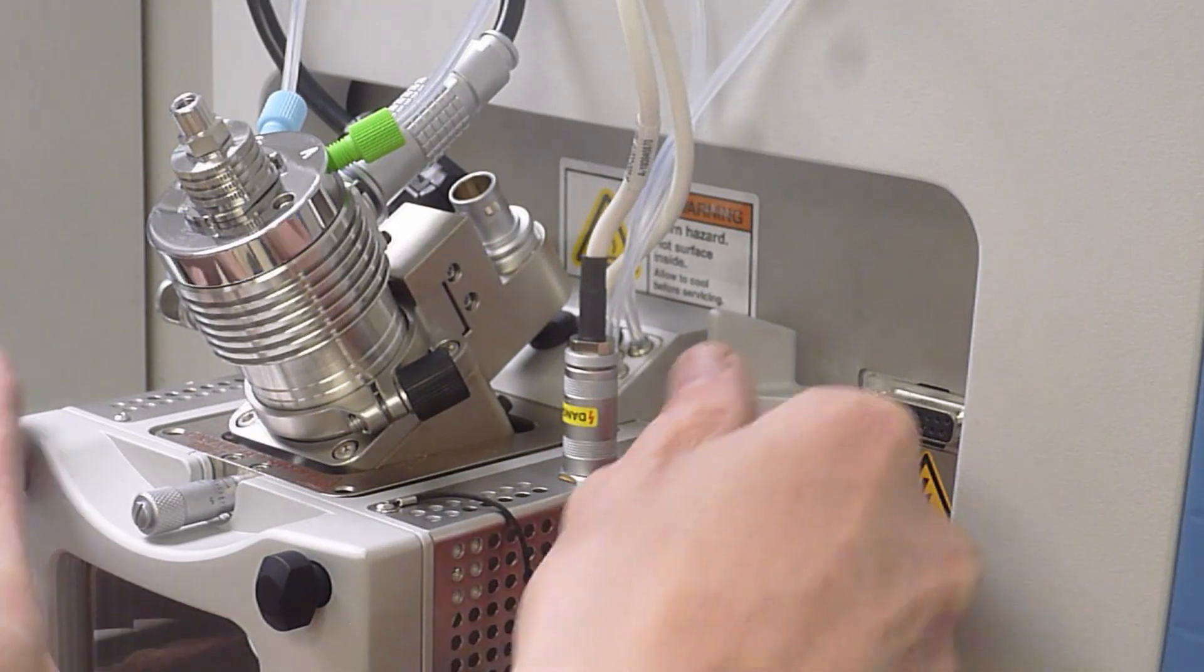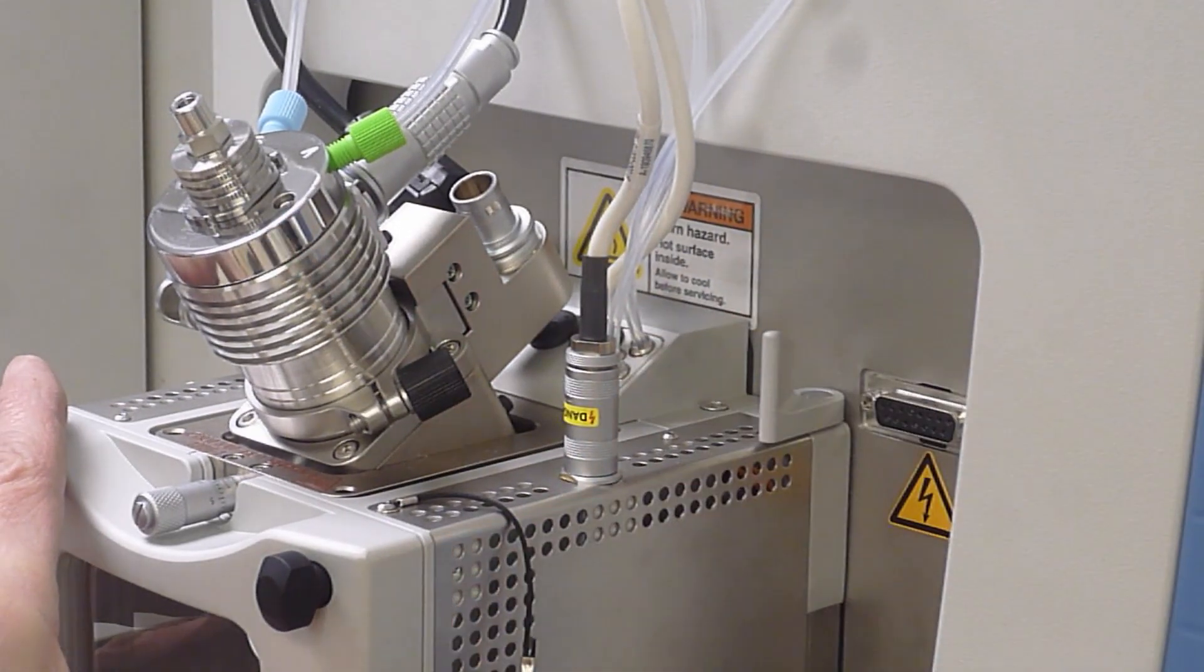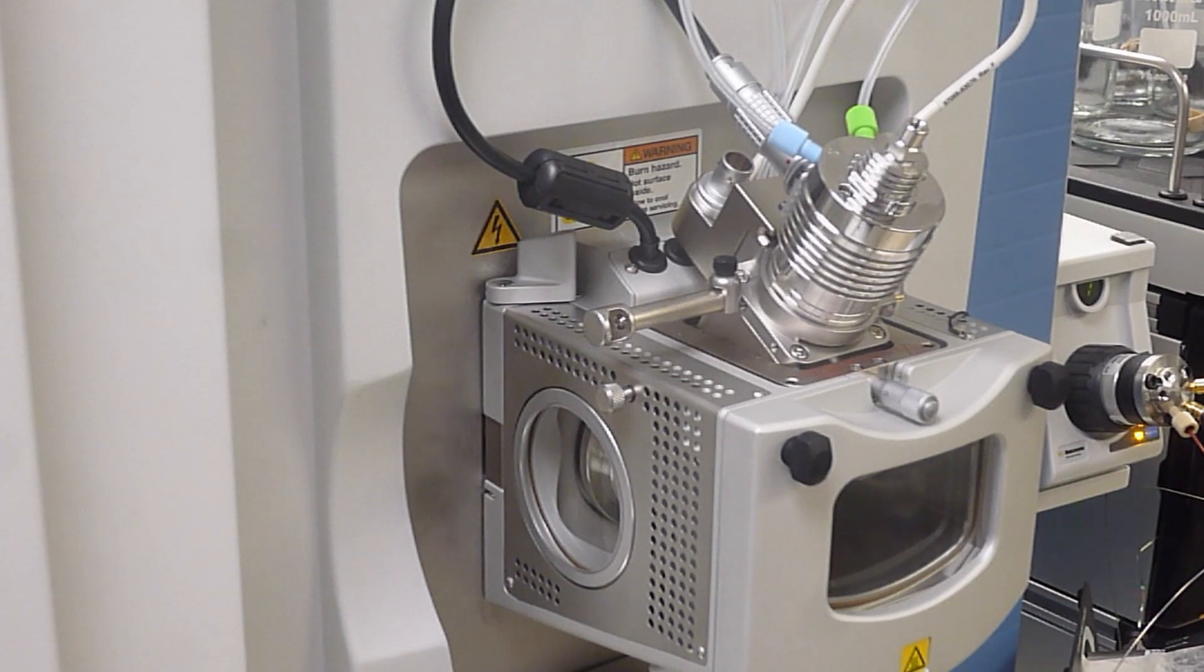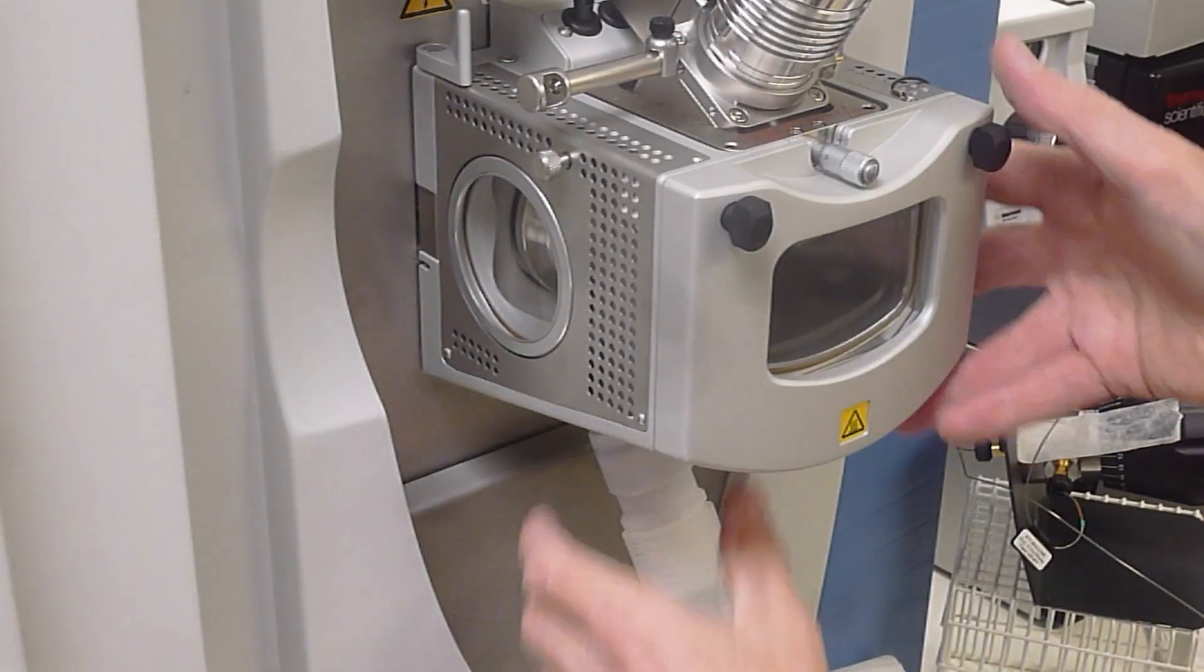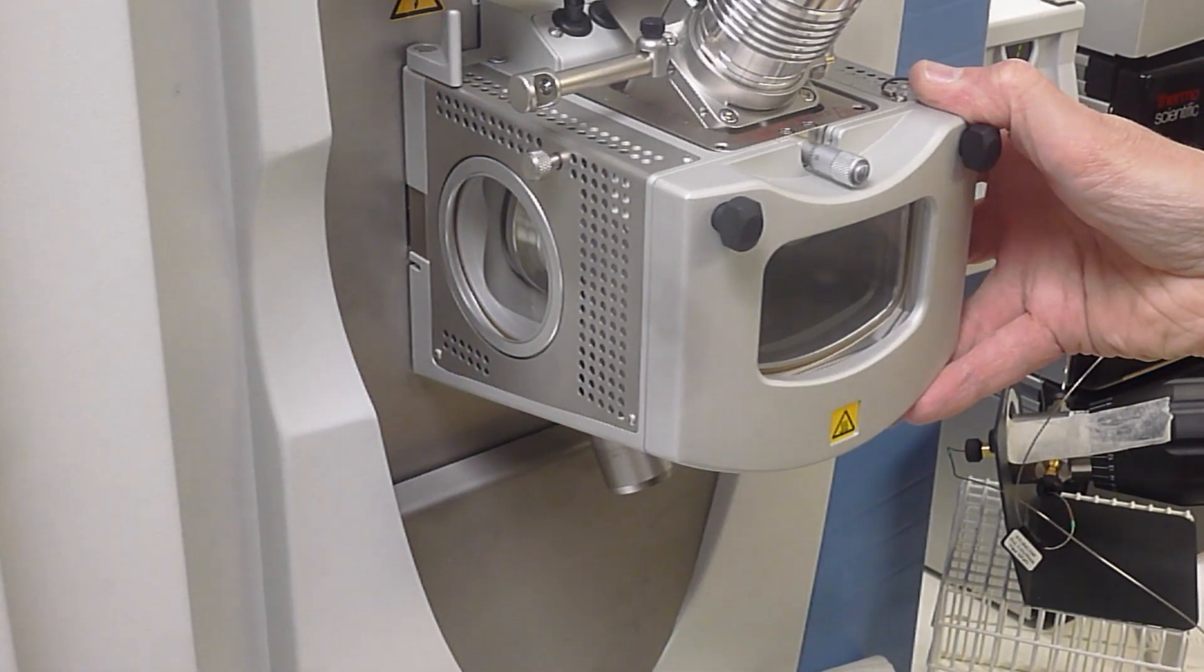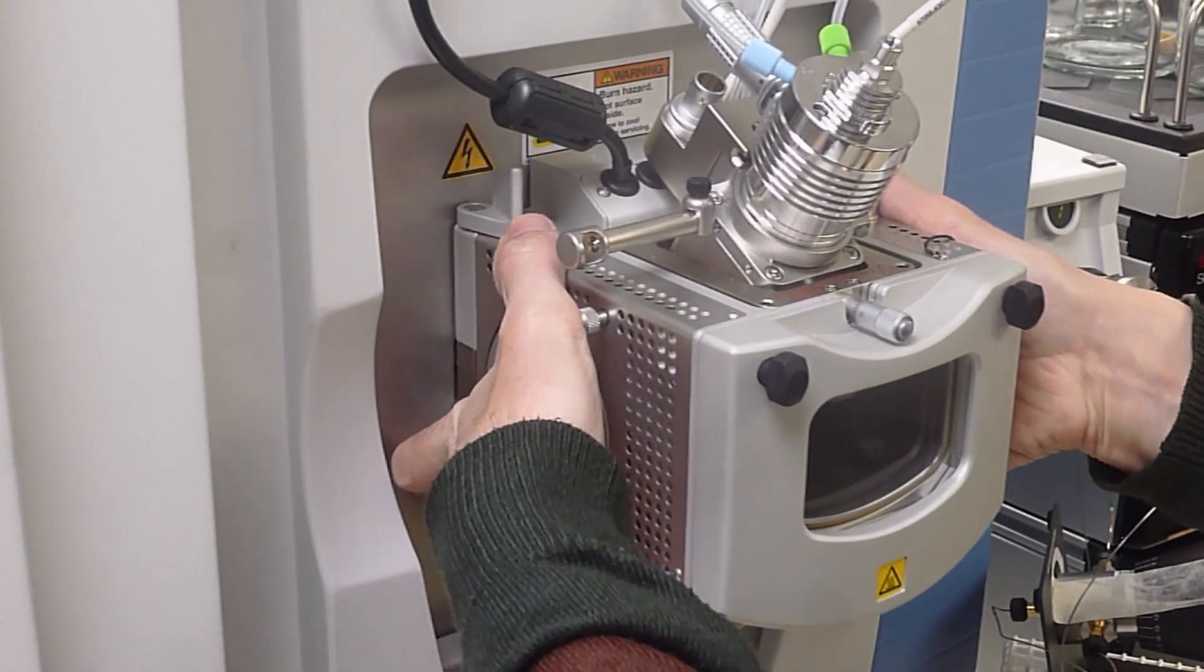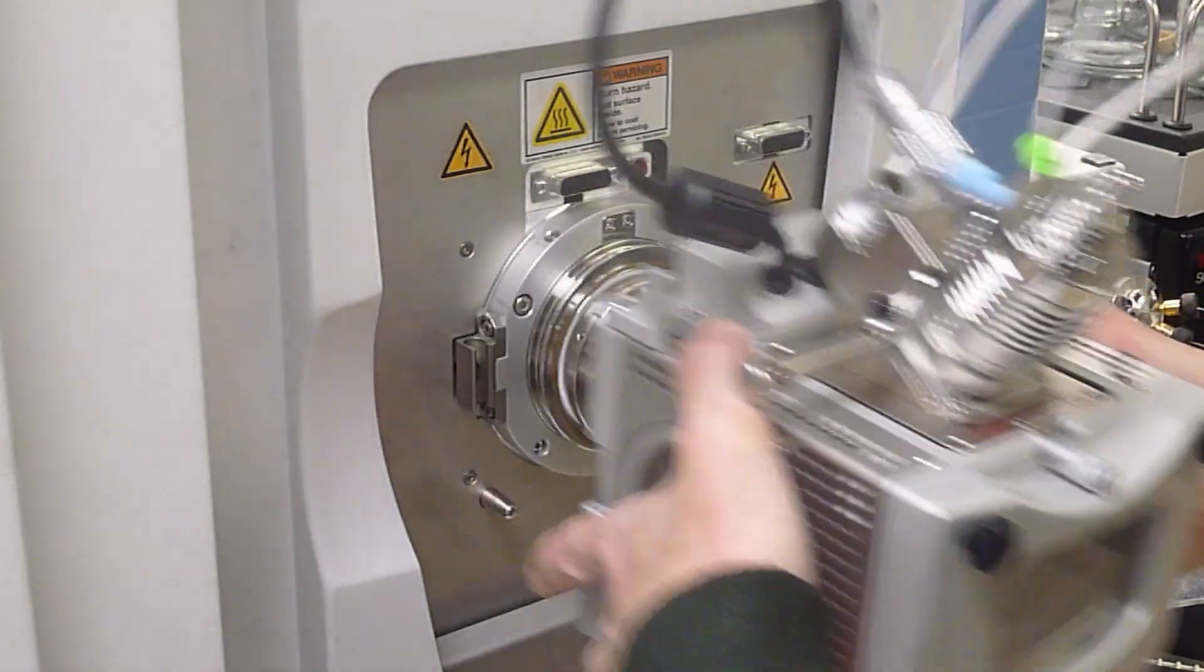Move the right hand tag outwards. Move the left hand tag outwards too and don't forget to pull off the exhaust tube from underneath. Now you can wiggle the entire spray chamber off. Be careful it's quite heavy.